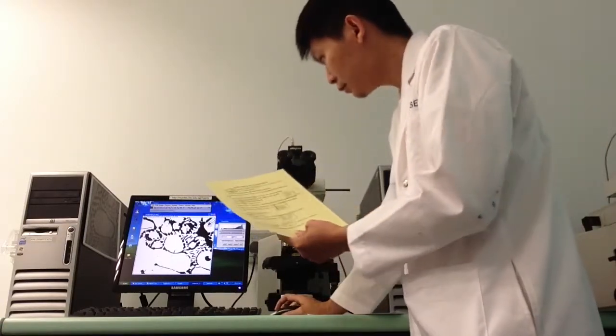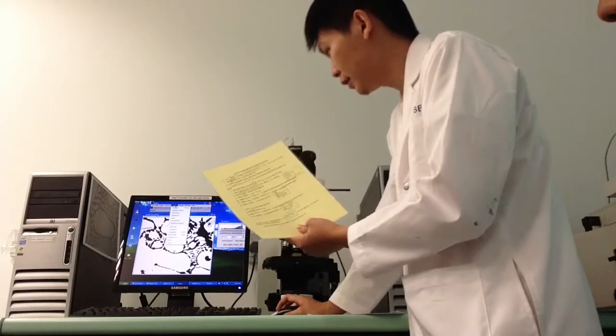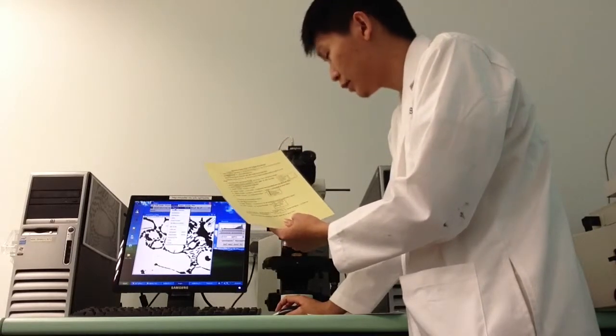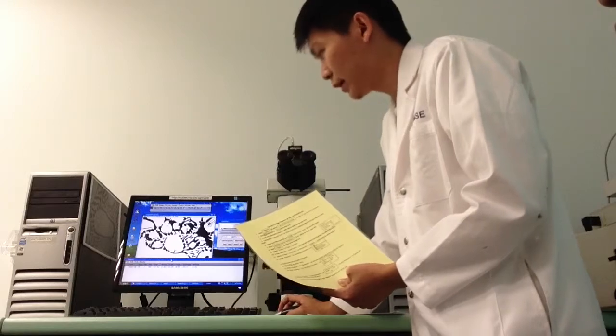After which you click Analyze, and Measurement. Click Measure. This will actually give you a set of data.